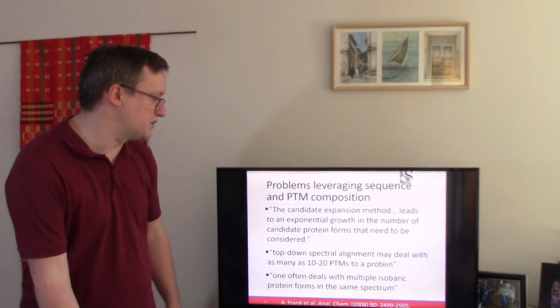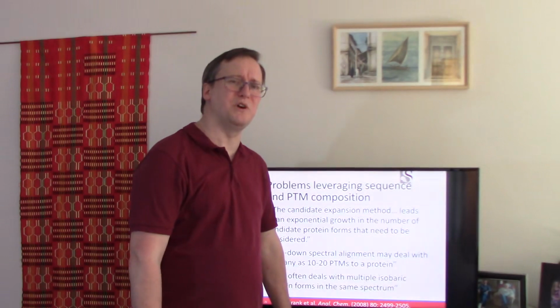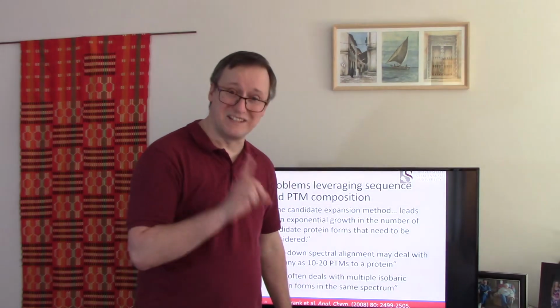One often deals with multiple isobaric protein forms in the same spectrum. Now this is kind of rare because you don't generally see computer scientists calling out analytical chemists for shortcomings of their data. But sometimes the shoe fits.